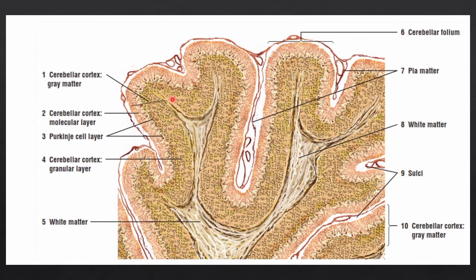This is a special stained section of the cerebellum. Sometimes these special stained slides are also given as spots, if H&E staining is not present.